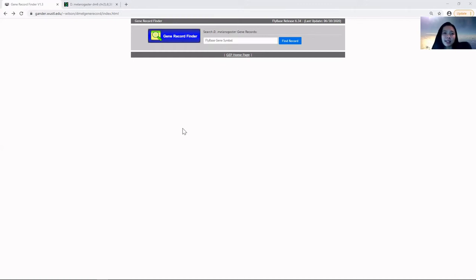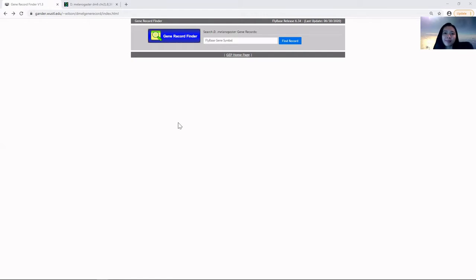Hello everyone, my name is Cece and today I will be giving you a brief walkthrough on how to use the gene record finder.